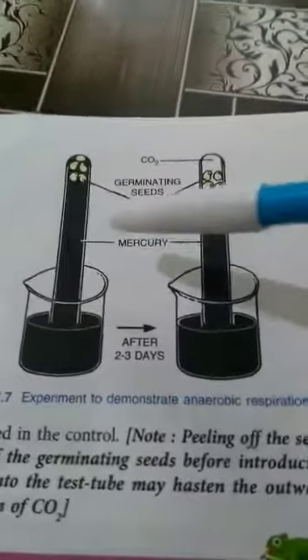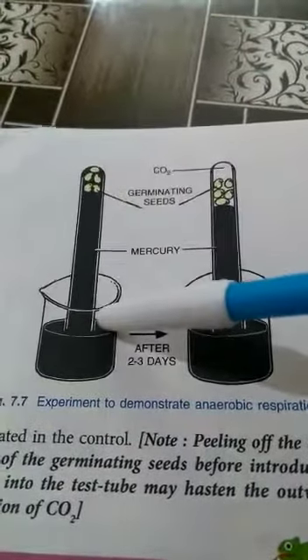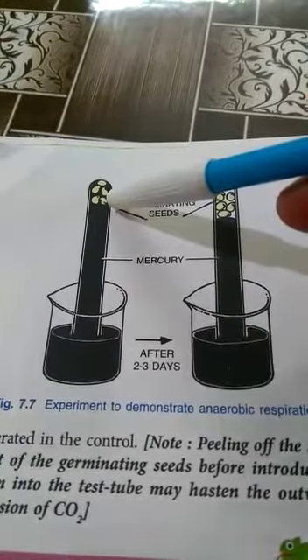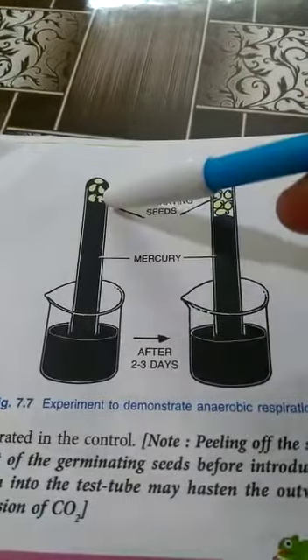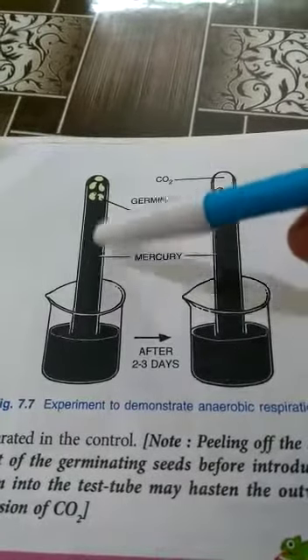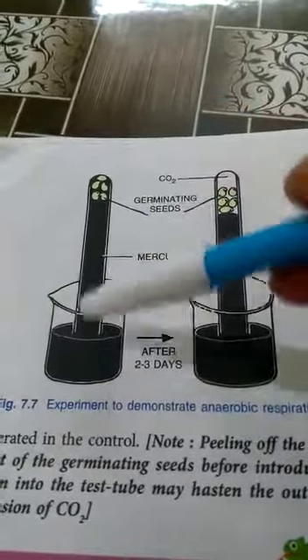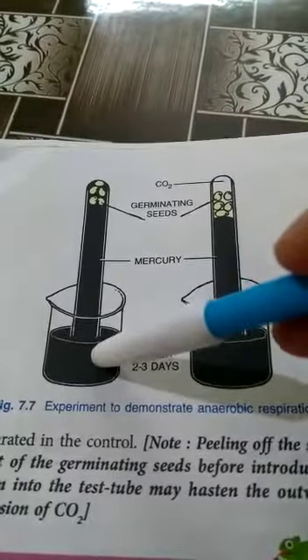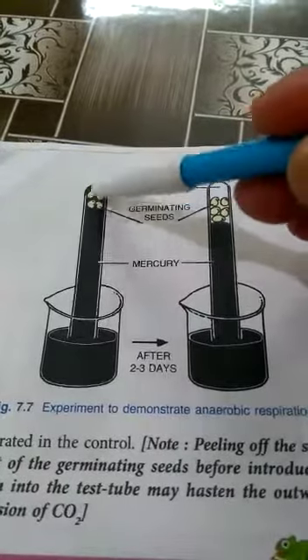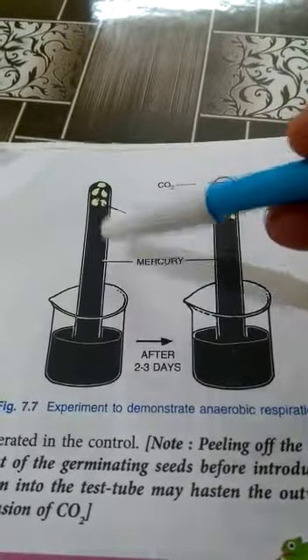Now the next experiment is to demonstrate anaerobic respiration. To demonstrate anaerobic respiration, we will take a test tube. In that test tube, we will place some germinating seeds. Now we will add mercury in that test tube. Okay. So now we will invert this test tube in a jar containing mercury. So these seeds will be completely surrounded by mercury.